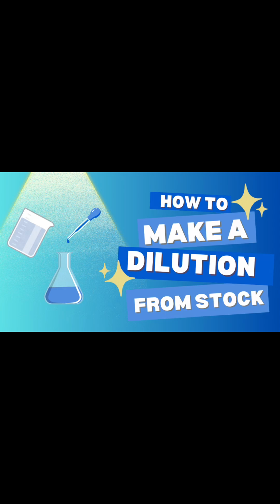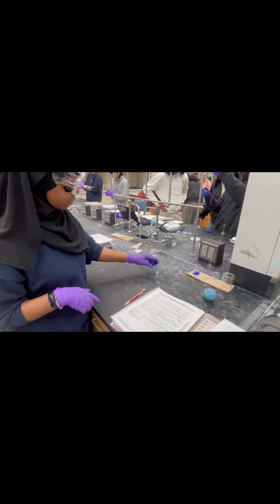Today, we'll be demonstrating how to make a dilution from a stock solution. As always, you need to make sure you're in proper lab attire, which includes gloves, goggles, long pants, and closed-toed shoes. After you've rinsed and primed your graduated pipette, pour some of the stock solution into another beaker so you aren't pipetting directly from the stock bottle.